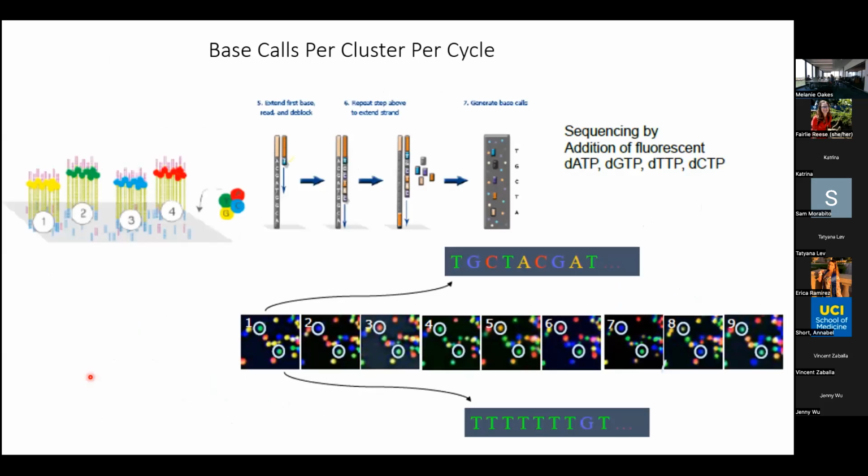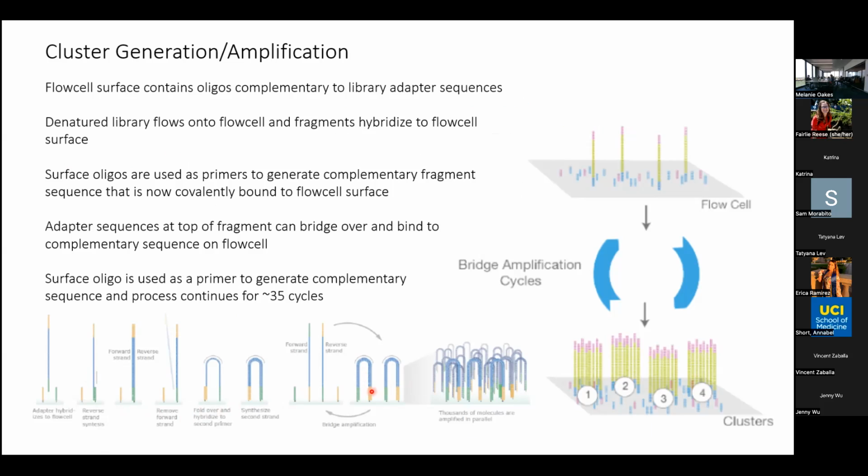Sorry, Melanie. Can you, I didn't quite understand the PCR amplification bias thing. So at the end of the day, are you saying that it's more likely that you miss shorter reads, or what's the? No, it's just that this PCR amplification could introduce some mutations. So it might be substitutions, and it's not going to be on all of them, okay? If it happens early on, then it might be, okay? But this is where anytime you're doing PCR, there's going to be some bias, okay?